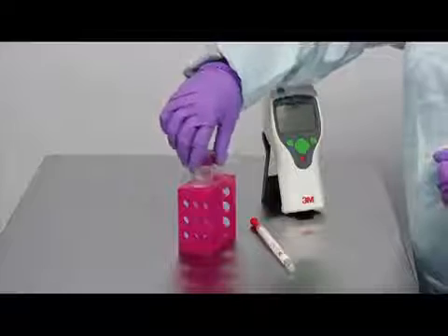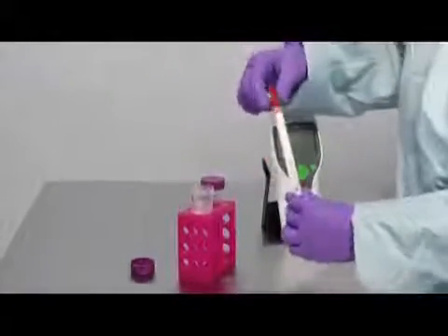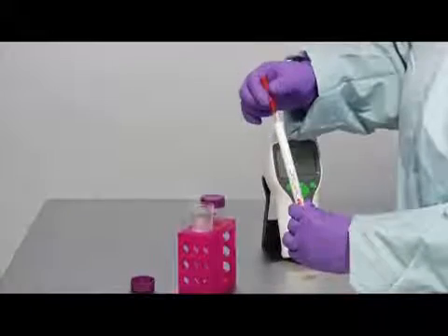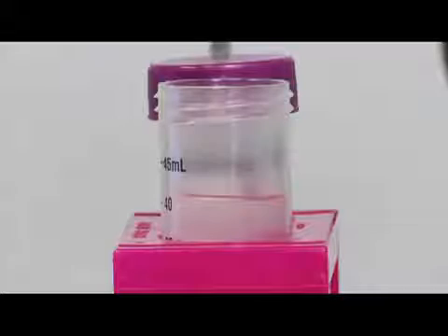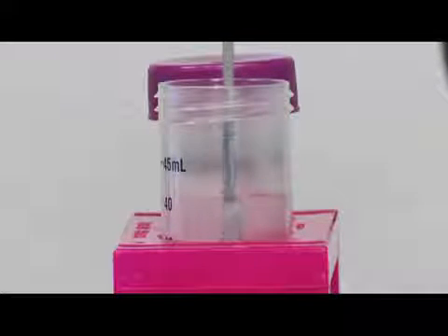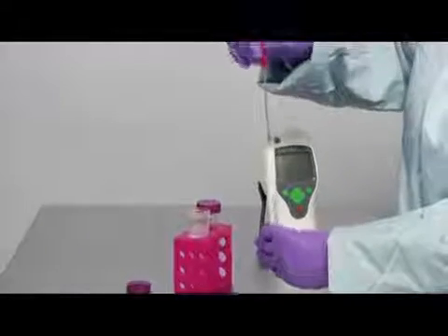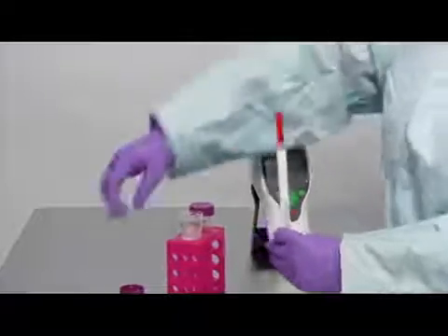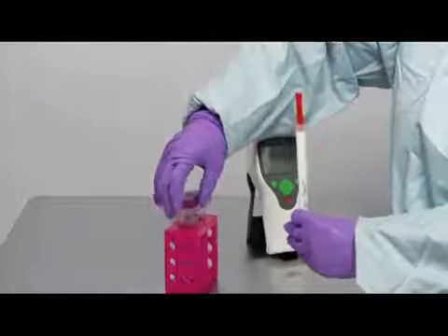Next thing you're going to do is test your water sample for ATP levels, and so we're going to use the ATP water test, which is a molded plastic honey dipper apparatus with sample collection rings. You want to dip this just to the tapered collar, and dip it right up to that level. Carefully insert that into the sleeve, recap your sample, and then this gets treated just like the surface test.